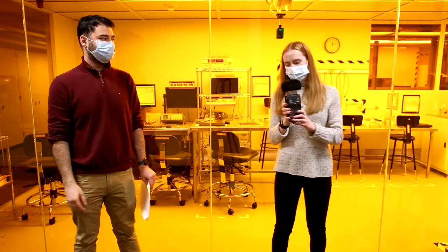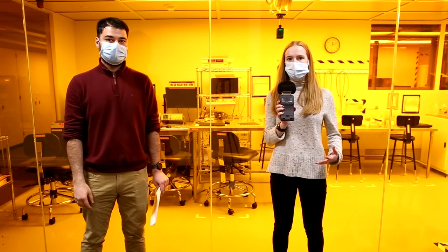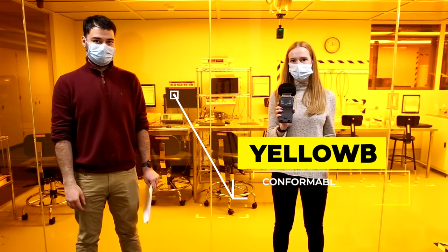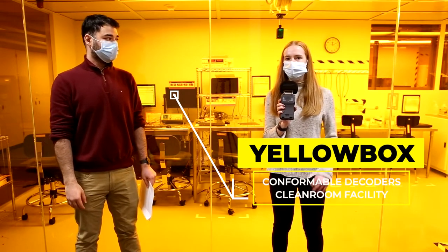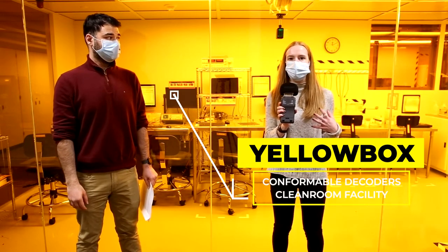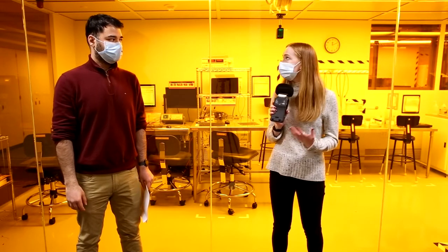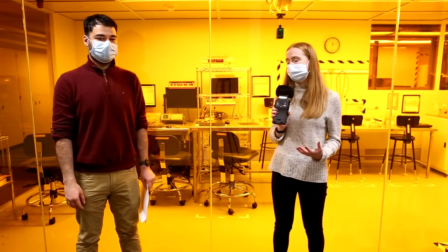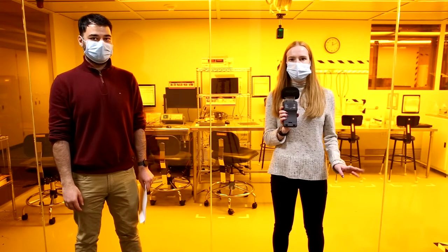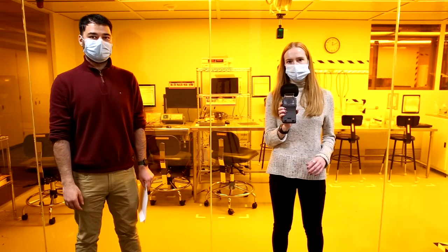Yeah, so today we're going to be taking you on a brief tour of the academic clean room that we have here at the Media Lab, which is nicknamed the YellowBox for obvious reasons. We are going to start by explaining some basic background information, such as why it was built the way it's built, why it has that transparent nature to it, and also how it has that distinct yellow color. So to provide some insight on this background info, we're going to pass it off to the PI of this group, Professor Jananda Devran.